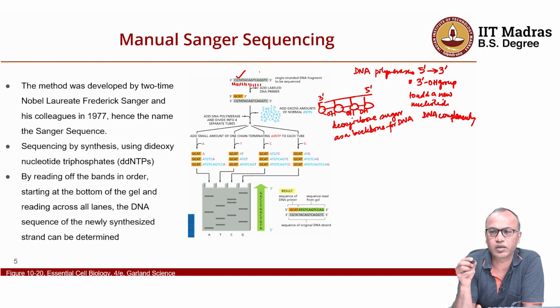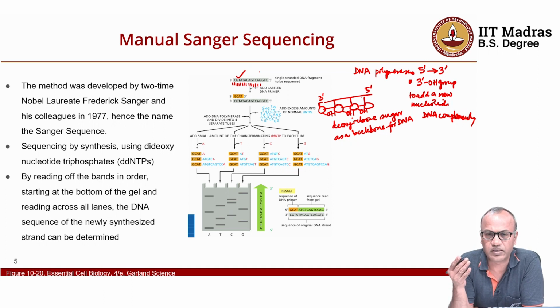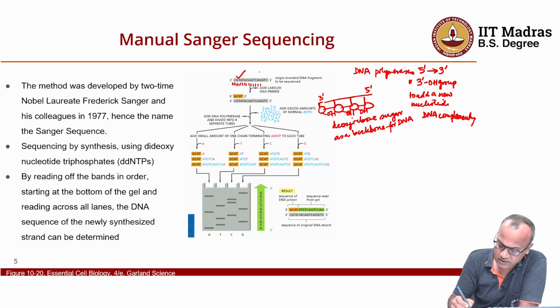And this is what was used as a method of reading. So, reading by sequencing a novel complementary strand of DNA. So, sequencing by synthesis.